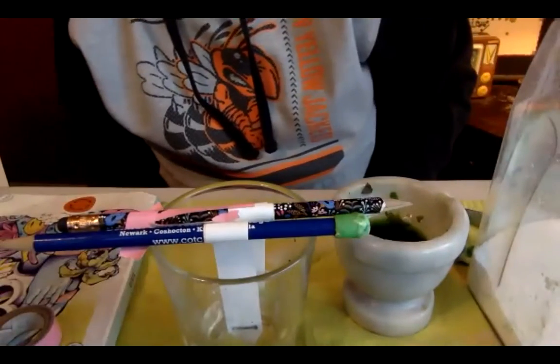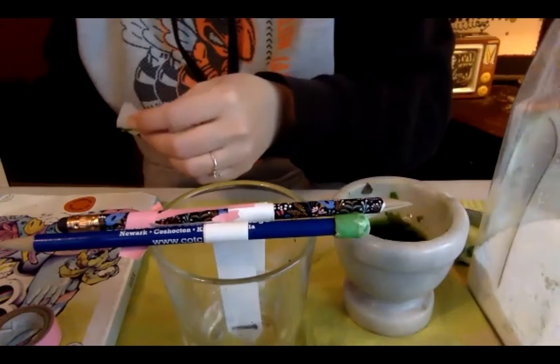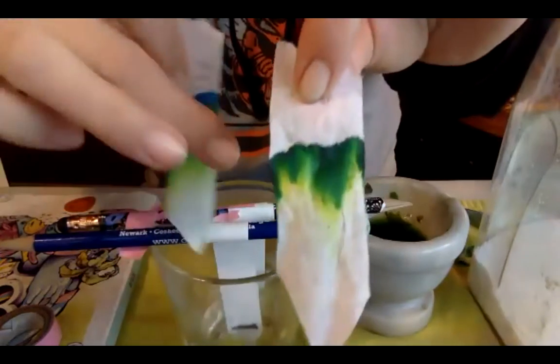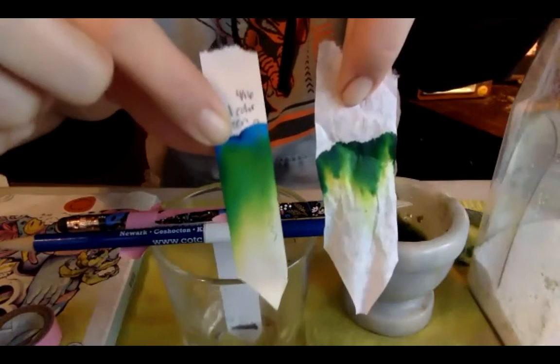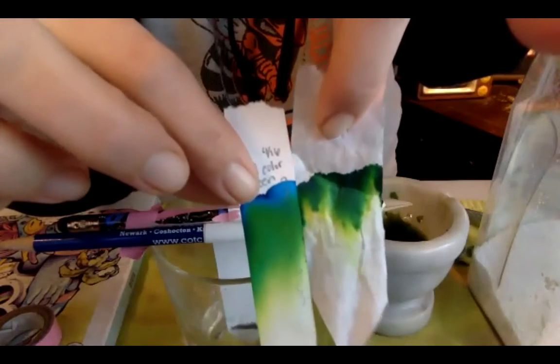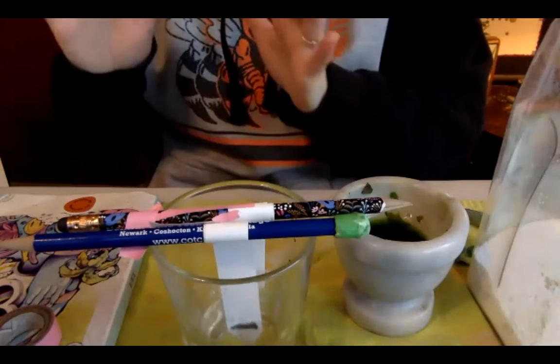I'll probably put some photos of these things on Instagram later, just for fun, because they're pretty. Here's the plant, or sorry, the green food coloring. You can kind of see the difference between the chromatography paper and the coffee filter. It's a similar effect. It just doesn't separate as much. The green is a tighter band, and the blue didn't come out quite as much. But maybe if I'd let it go. I was up doing this until about between 7 and 8 p.m. And I was like, oh, I gotta call it quits.